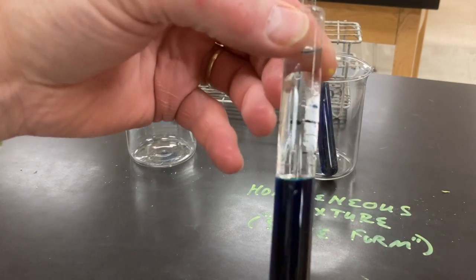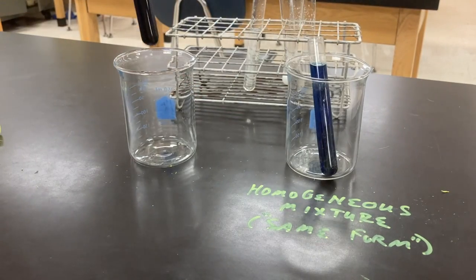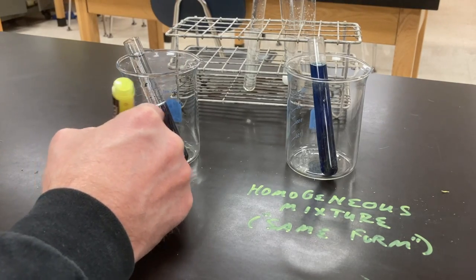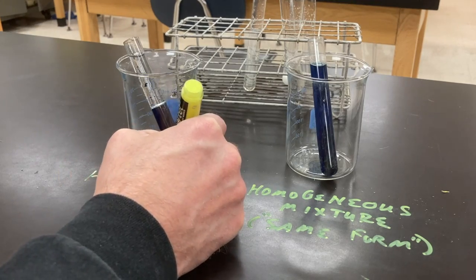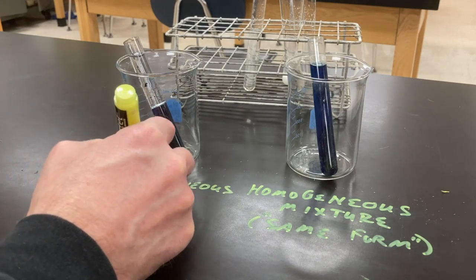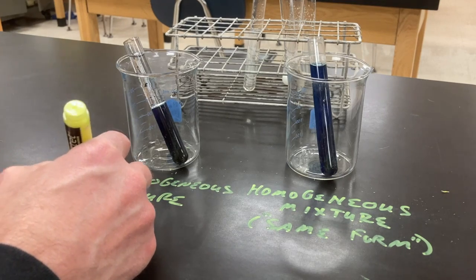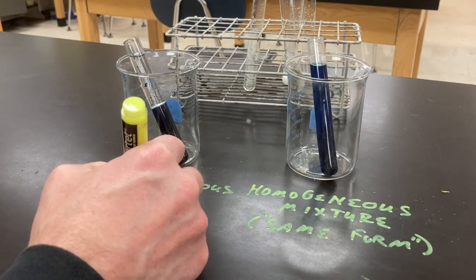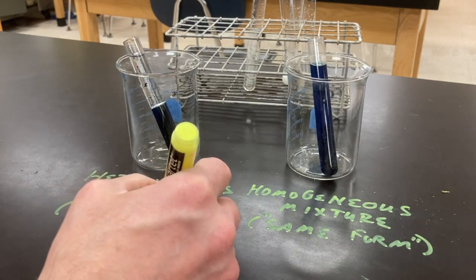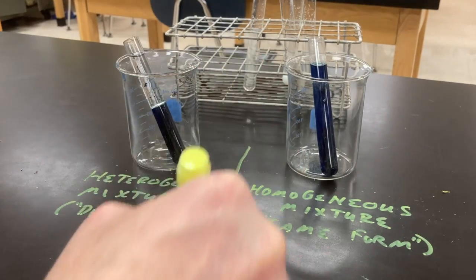This is our oil and water mixture. You can clearly tell that there's two things in there with your naked eye. You don't have to know the history of that test tube to know that that is not just one thing, that that's a mixture. That's an example of what we call a heterogeneous mixture. So the hetero word part means different. So this means that there are different forms throughout the mixture. That's what that name means. So that's the two main ways that we can sort out mixtures, heterogeneous and homogeneous.